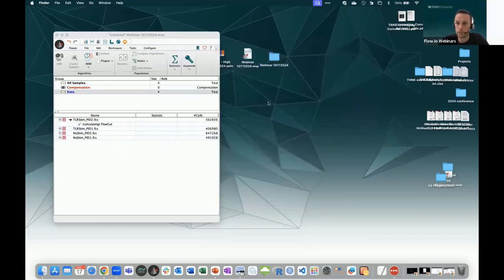So if you didn't save those images into your layout editor, you're gonna be able to find your report images here in that folder.